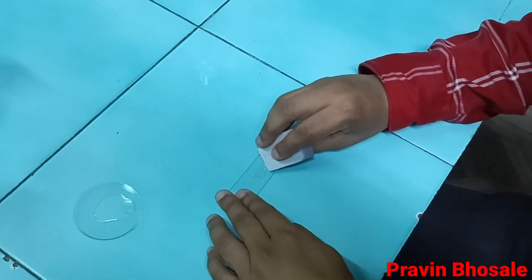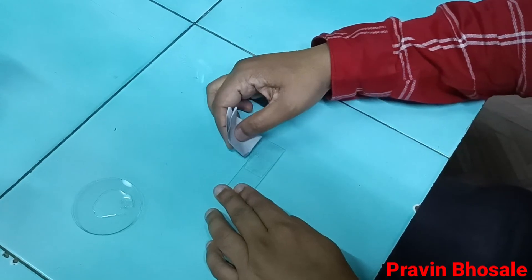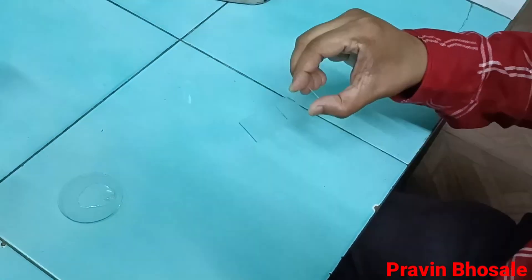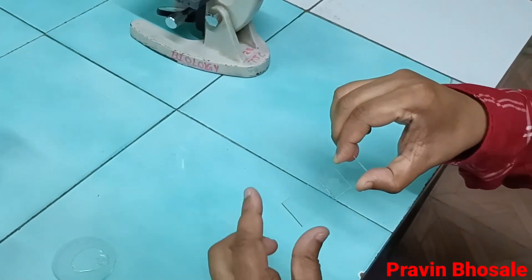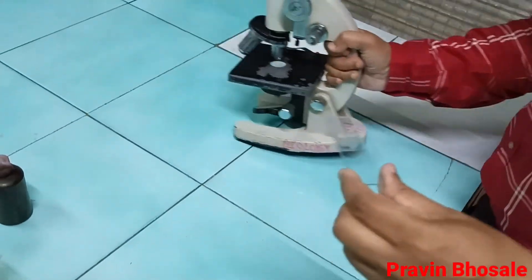You can see I am removing the excess of hypertonic solution — your slide should be clean. The slide is ready. The next step is adjustment of the microscope and placement of the slide on the microscope.